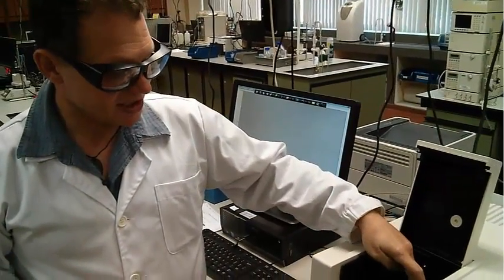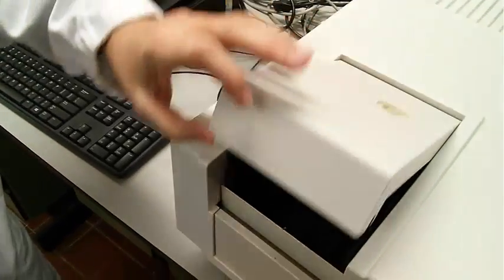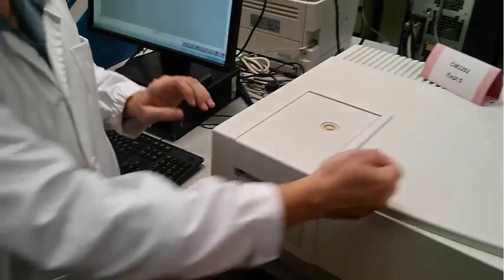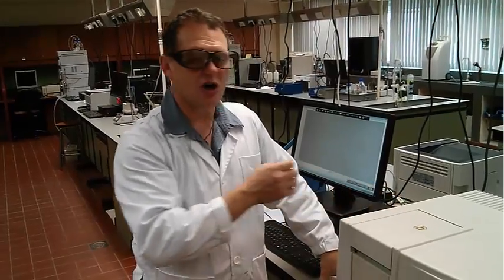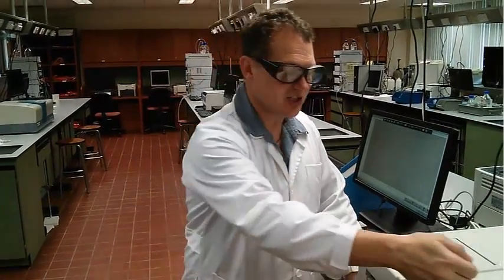The way this system works is the cuvette is placed in the holder, and we want to close the top because we don't want stray light going in there. From the side, the light is shone onto the sample. In principle, you shine light through the sample, and the molecules in the sample absorb some of that light at various wavelengths according to the assemblage of bonds.